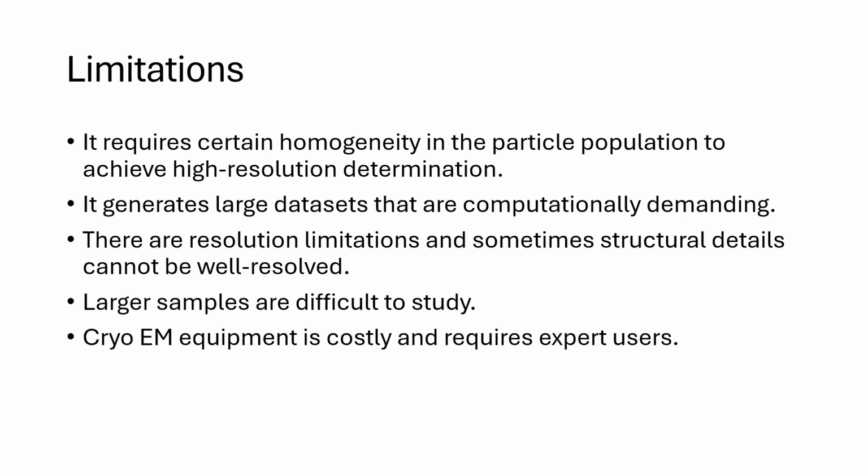Limitations of cryo-electron microscopy. It requires certain homogeneity in the particle population to achieve high-resolution determination. It generates large data sets that are computationally demanding. There are resolution limitations and sometimes structural details cannot be well resolved. Larger samples are difficult to study. Cryo-electron microscope equipment is costly and requires expert users.